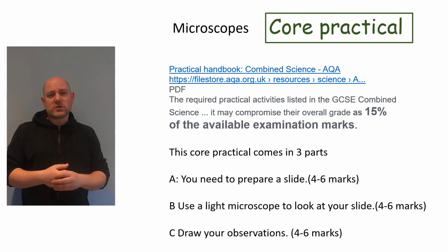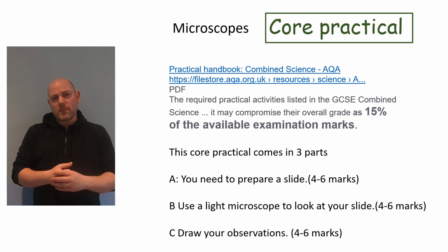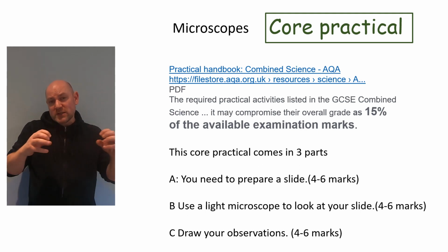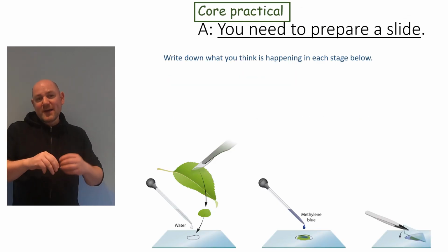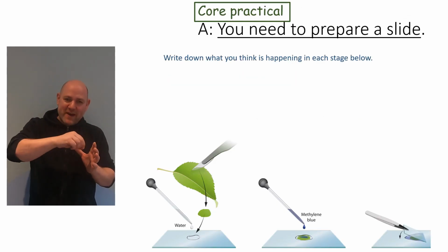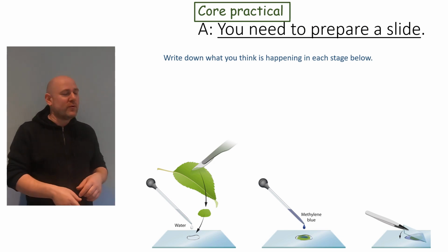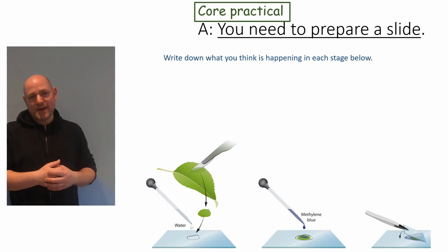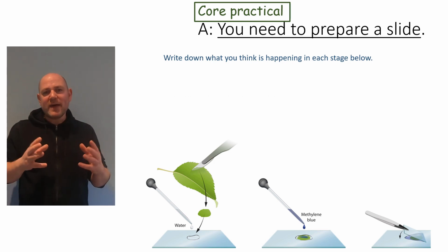I'm going to go through microscopes with you now, and it has 3 parts to the core practical. You need to know how to prepare a slide. You need to be able to use the light microscope to view a specimen. And finally, you need to be able to draw your observations of the cells that you can see through a microscope. So let's go through how to prepare a slide. So write down what you think is happening in these pictures, and then I'll take you through.